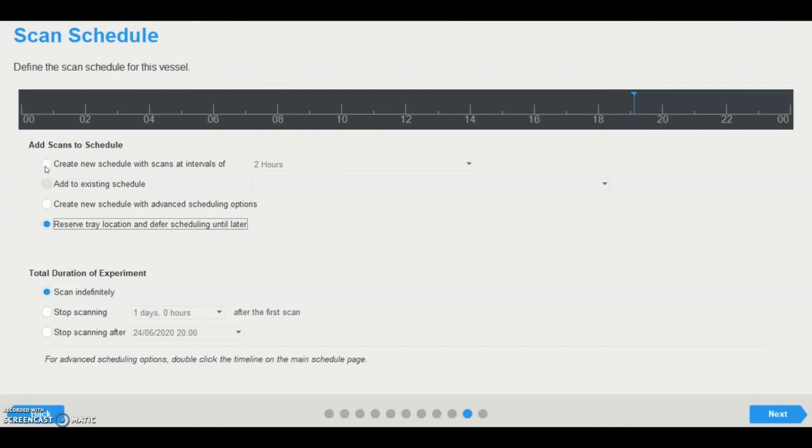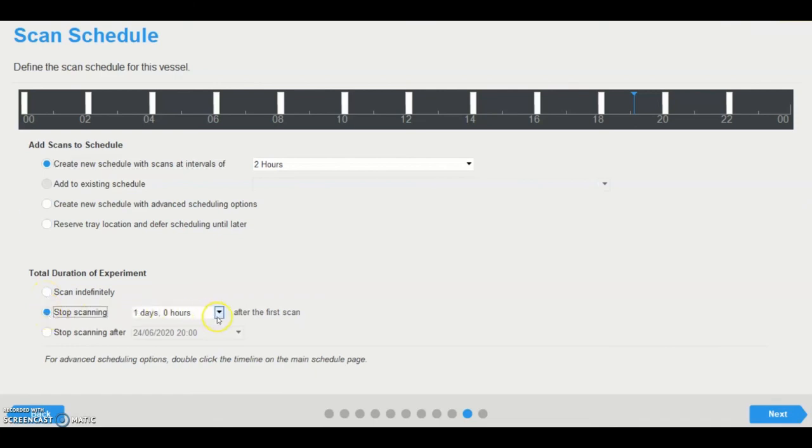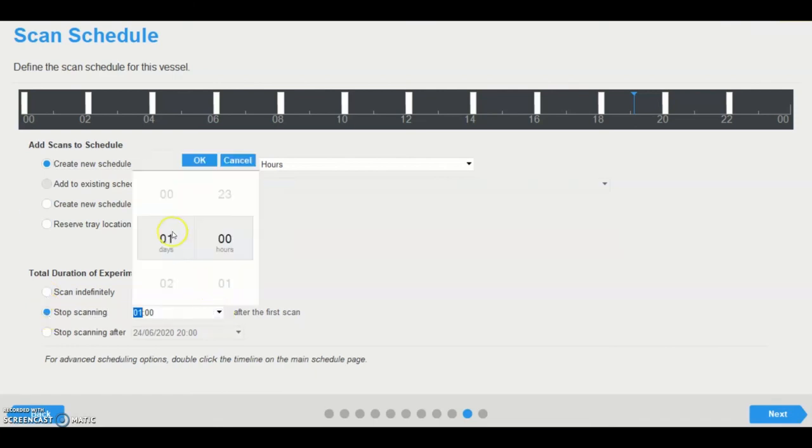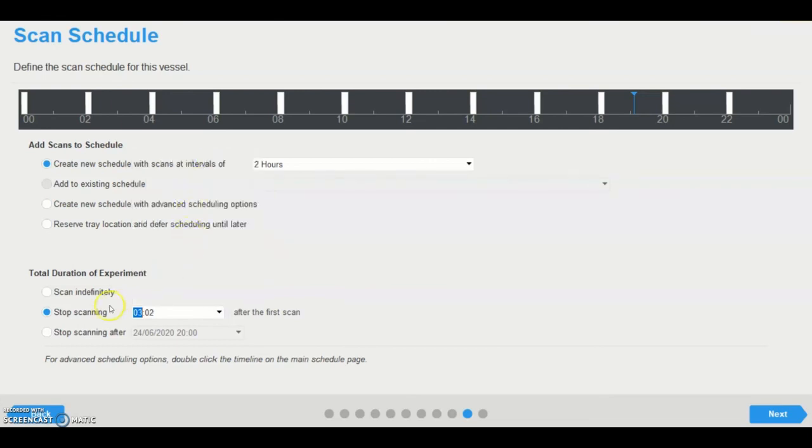Following schedule selection, the duration of the experiment can also be defined. Scan indefinitely will continue scanning until the user manually stops the experiment and is recommended for new experiments. The user can also define a specific end point, either a number of days or hours after the experiment commenced or a specific date and time.